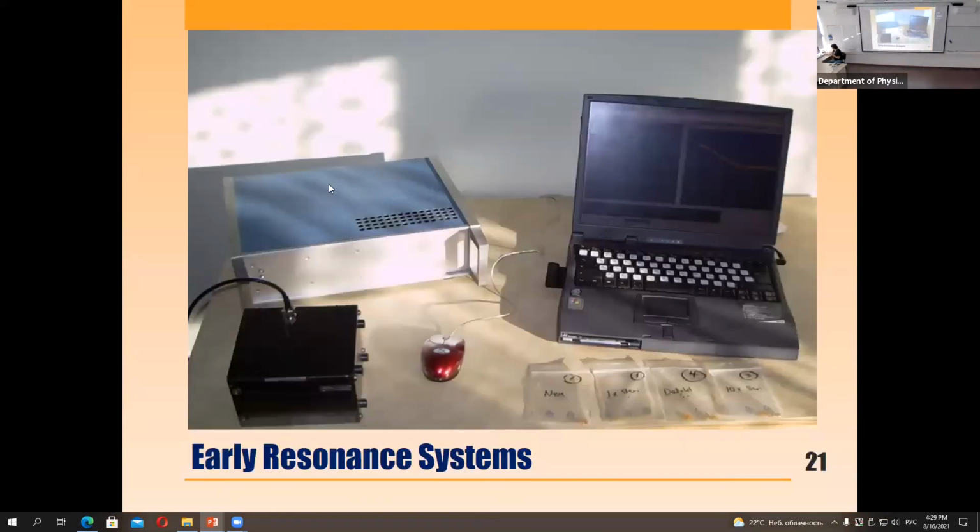So let me now switch to what we have done. I built my first NMR in 1995. It was built on absolutely Soviet transistors, chips. That was really funny, but that was working. In 2000, I managed to somehow enter the Blümich group in Germany, and we started to work more effectively. So this is something like our instrument looked 20 years ago.